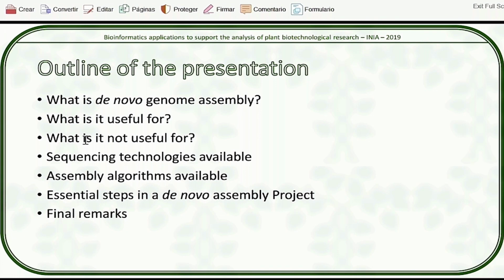Finally, we're going to see step by step what the tools and methods are and the reasoning behind all the steps for genome assembly, from the pre-processing and data exploration of our reads, all the way to the assessment and validation of the reference genome that you just built. All right? We have a very small test where you will run your own genome assembly on your laptops, if you have enough memory, if it doesn't crash. But it's a very, very small genome.